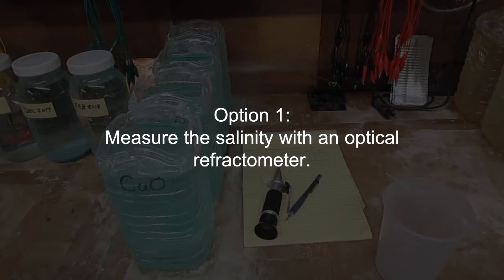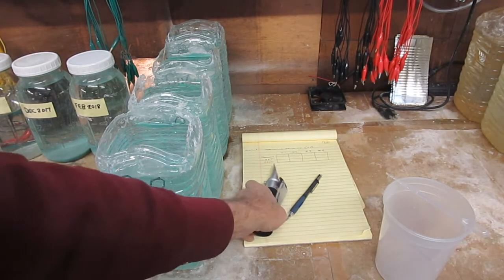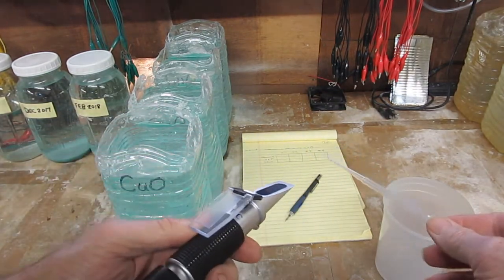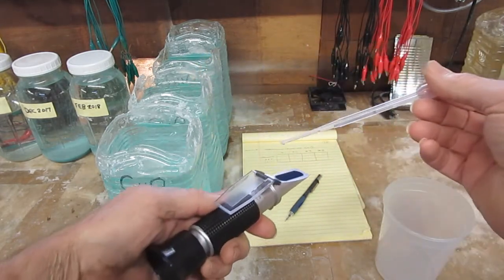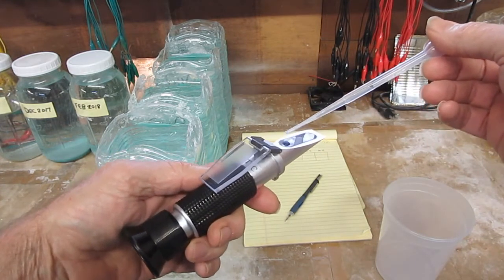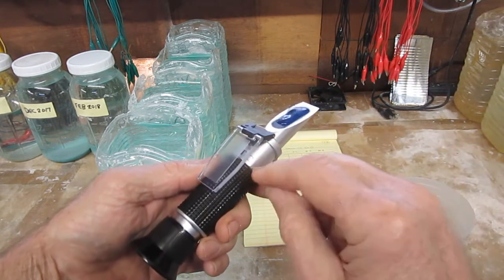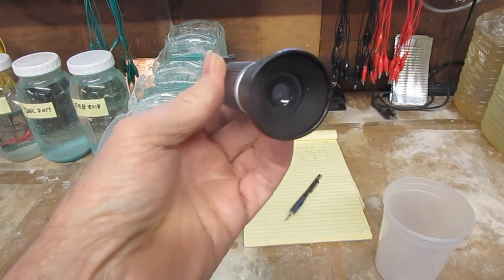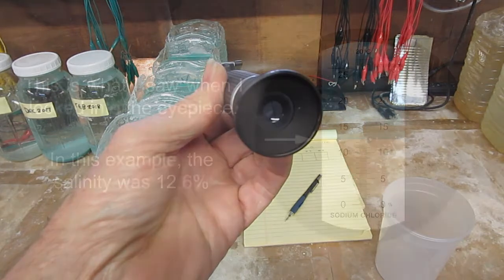There are a couple of ways to measure the salinity. The easiest way is to use an optical refractometer. Place a few drops of the test water on the prism surface. Close the prism cover so that the water spreads out evenly and covers the entire surface. Look into the eyepiece while facing natural daylight or bright lamp.